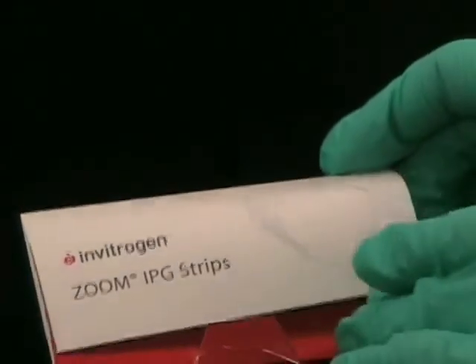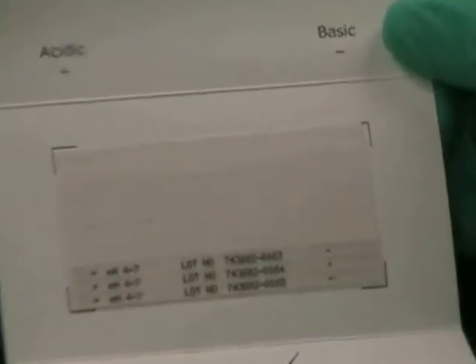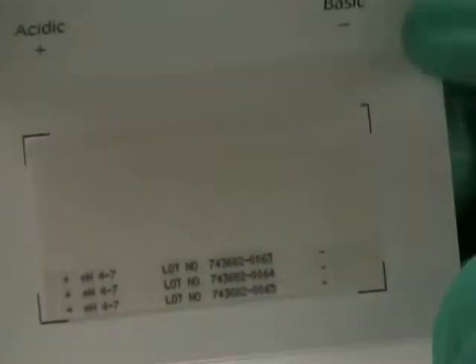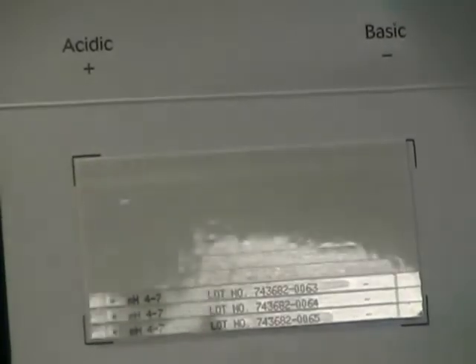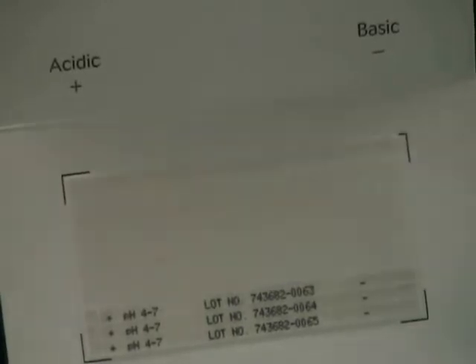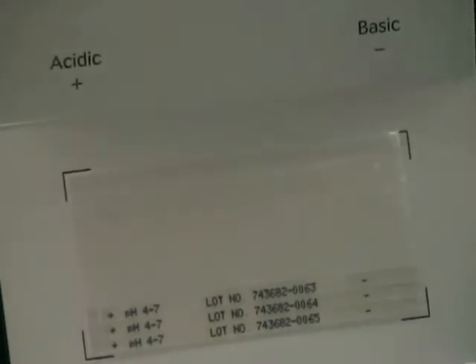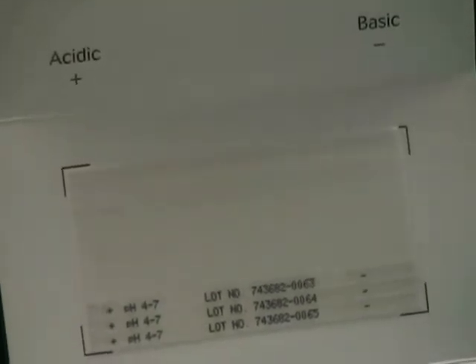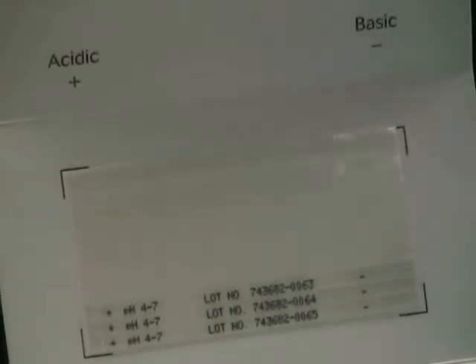The IPG strips have a pH gradient. We see here that these strips have a positive side, which is acidic, and a negative side, which is basic. Each strip has a gel side and a plastic side with printed markings on it. The gel has a pH gradient — in this case from pH 4 to 7. We can also use other kinds of strips with other pH gradients, for example pH 3 to 7 or 5 to 6.